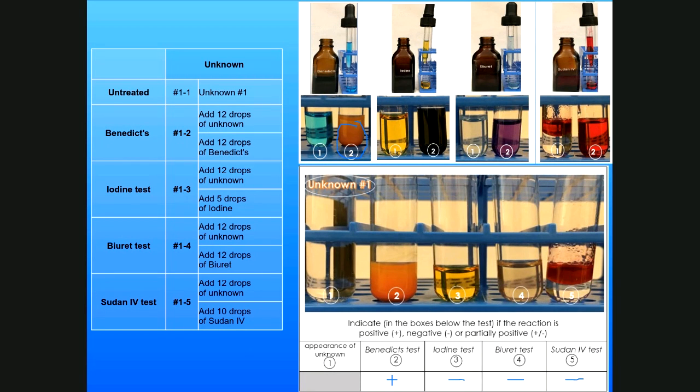So the only thing that's in here is a reducing sugar, and you can think about what this possibly may be. It's clear, it doesn't contain anything but the reducing sugar. I'll give you a list of possible things it could be later on, and then hopefully you can mix and match and see what that is.